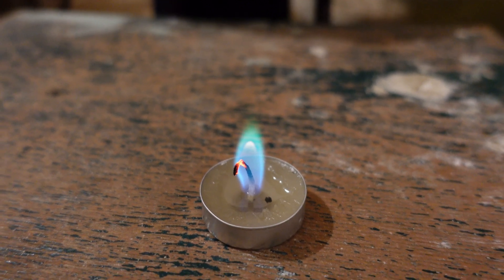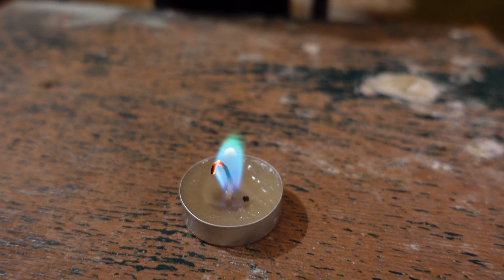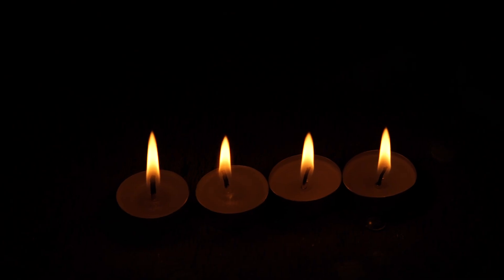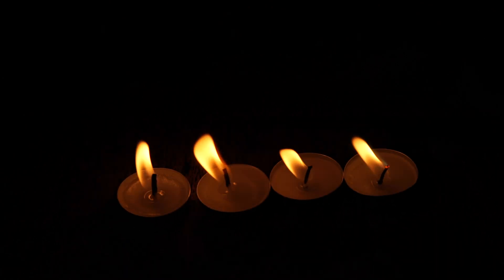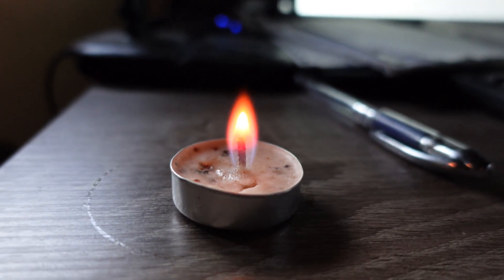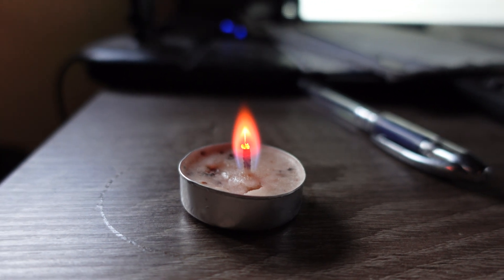They're not difficult to make. To put it simply, the most important thing is to choose a compound for the candle body that has a high oxygen content and burns with a colorless flame. It's also important that this substance has a low melting point. Paraffin obviously isn't suitable because it burns with a very bright yellow flame, although adding paraffin or stearin to the body of such a candle is possible. Then you need to choose an inorganic salt capable of coloring the flame and introduce it either into the wick or into the candle body, or both.